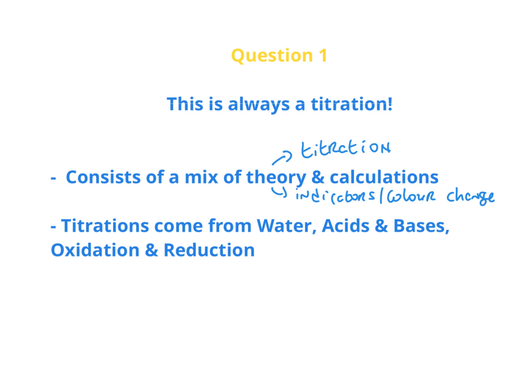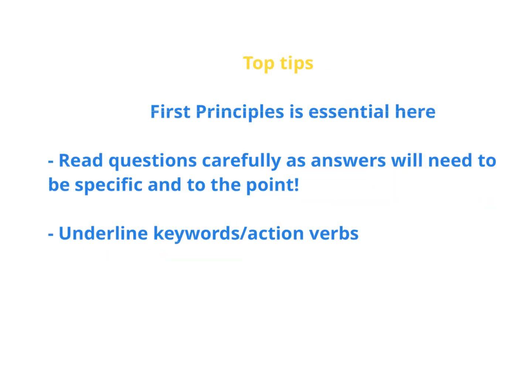So it's just important to know that although the titrations are in question 1, you do need to have a little bit of a background on your theory of the titration that's in question and the chapter that it originates from. So for example, in this question today on our water crystallization experiment, we're going to see that you have to justify the choice of indicator that you use in your titration, and this will be coming from your pH and indicators chapter.